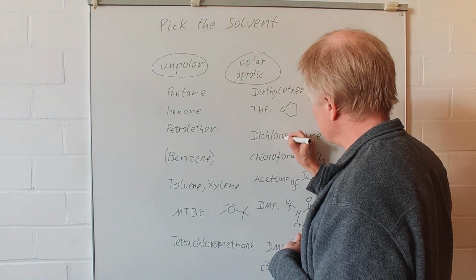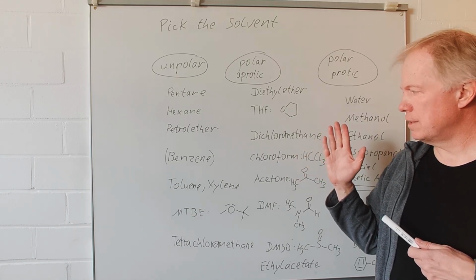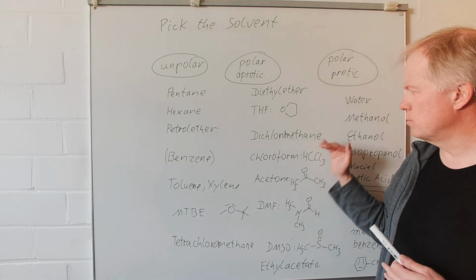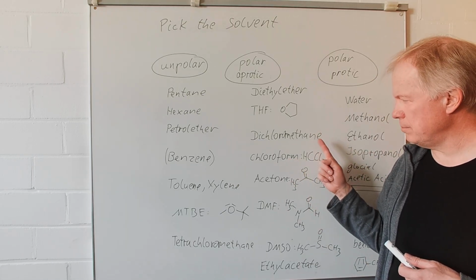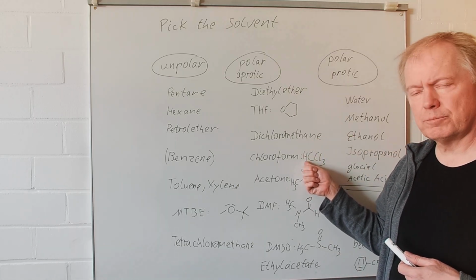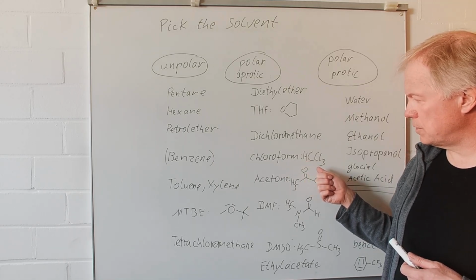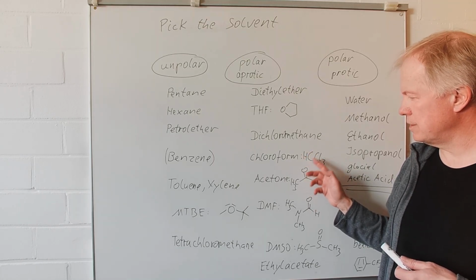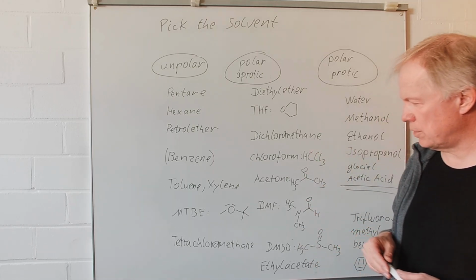Then we have dichloromethane. Well, a very good solvent, but because of environmental reasons, one is trying to avoid that. Chloroform, the same, with the additional problem that this single proton here becomes rather acidic, as you know, with potassium hydroxide, you can already deprotonate here, getting that anion, losing a chloride and forming dichlorocarbene and so on.